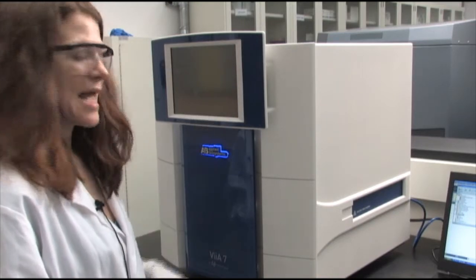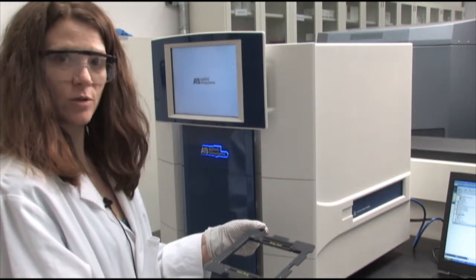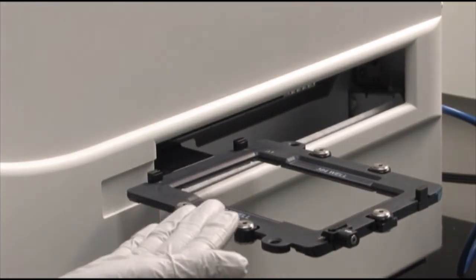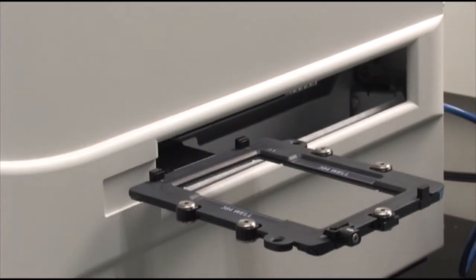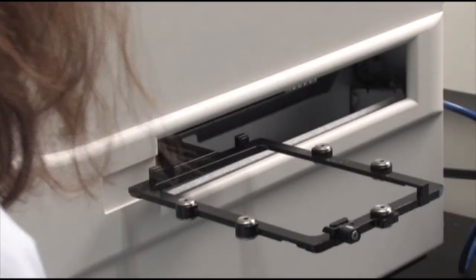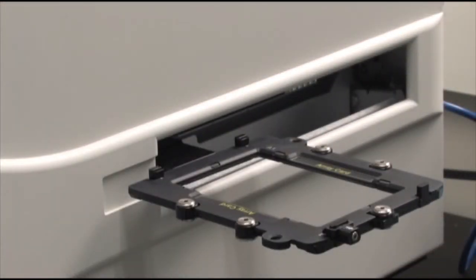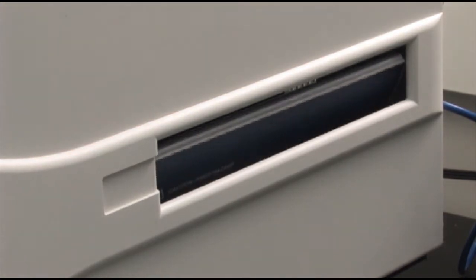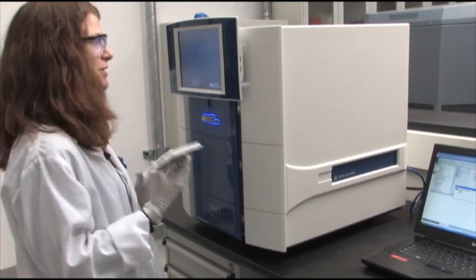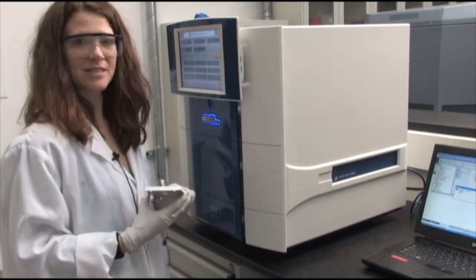The touch screen will boot up, and we are ready to put in the Array card holder and the Array into the side of the instrument. We're going to change the 384-well card holder to the TaqMan Array card holder. Now we are truly ready to load our TaqMan Array card. We have the TaqMan Array block, the TaqMan Array card holder, and here we go.